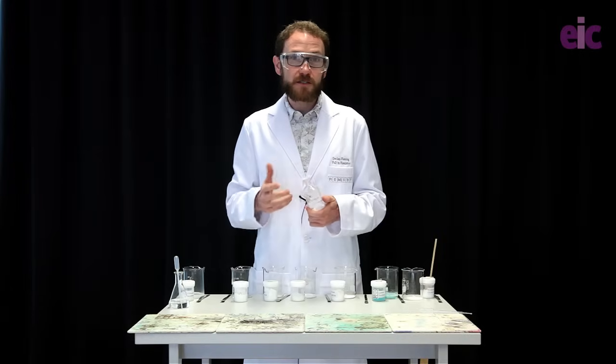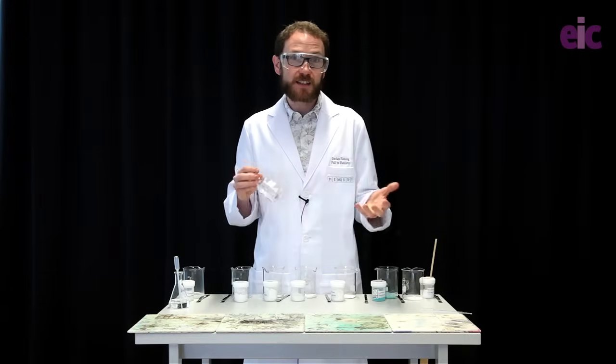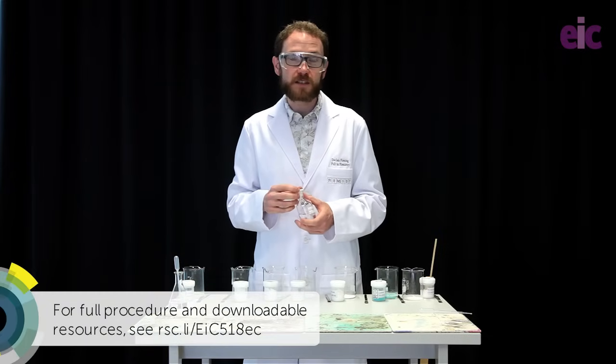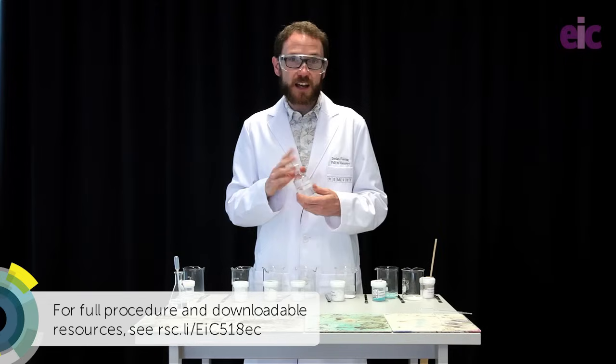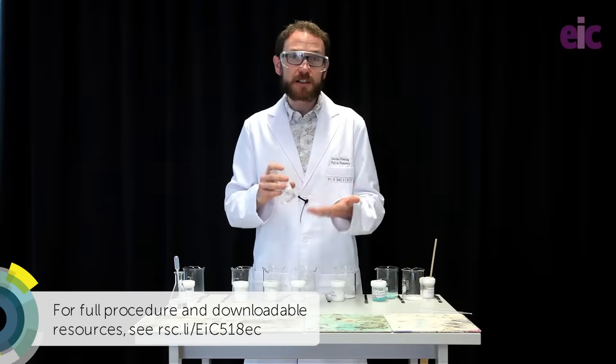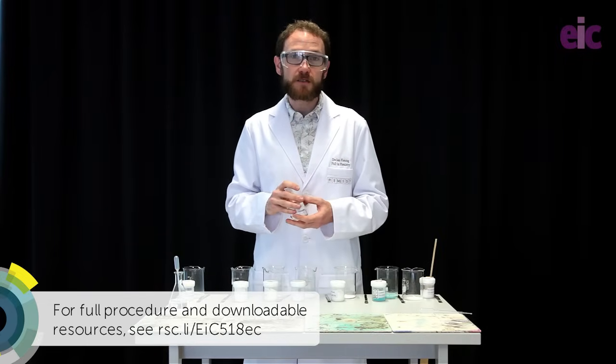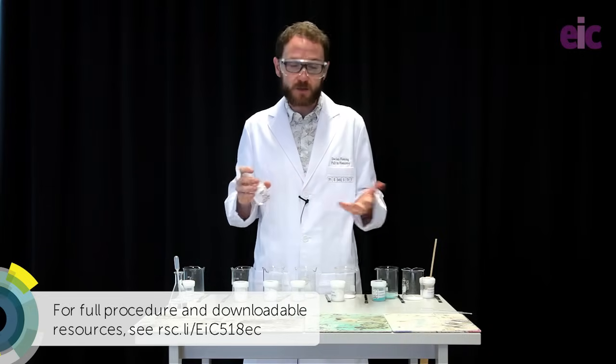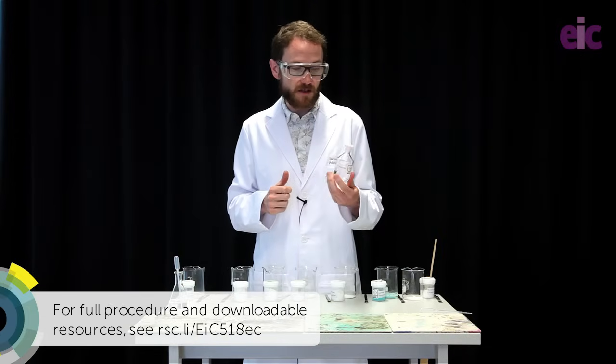The main trick to doing this demonstration safely is going to be down to solvent choice. A lot of injuries have been caused by using methanol in the past. We're going to be using ethanol today. There's absolutely no reason to be using methanol — it has an incredibly low flash point and it's actually toxic as well. Ethanol is going to be a much better choice.